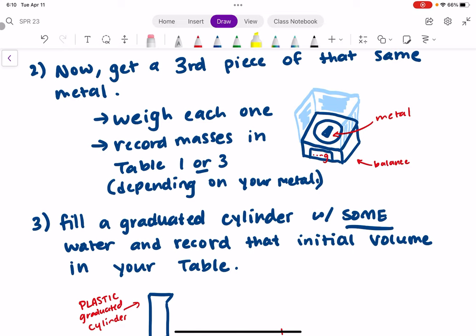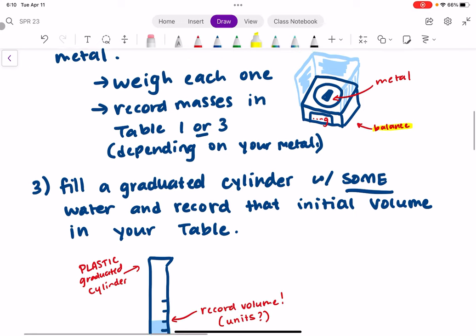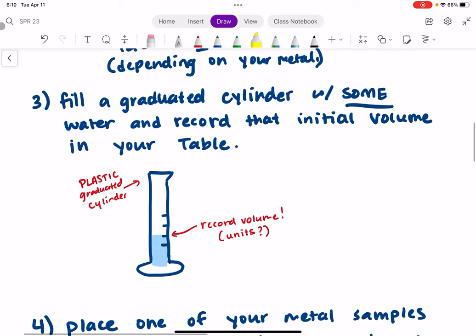The way you're going to get those masses is by using this analytical balance here. I'll show you a little short demo of how to do that in lab. So you'll get your masses, you'll record those.